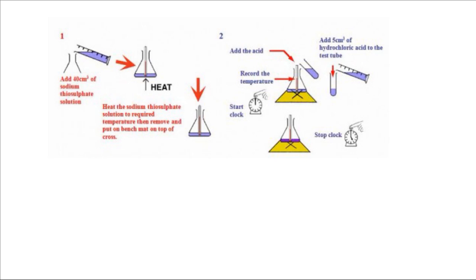There's a point that you continue to add. The yellow precipitate has still not been formed at that point. Then there's a stopwatch there. There is a thermometer to record the temperature up to the 30 we are talking about, the 60, the 50. Now, from this experiment, this is the kind of reaction we are going to have.